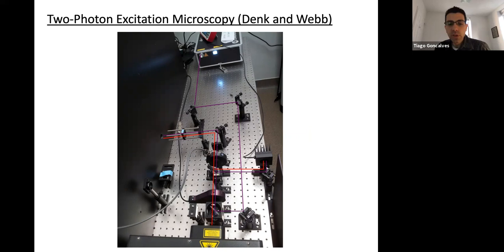So a little bit about the anatomy of this. Most lasers you'll find do not actually have a dial or anything to tell you, oh, you're going to use more power or less power. The lasers are always on or off. There's nothing else. So all laser systems will need some sort of power control system, and there's different ways of doing it. Usually they involve some sort of polarization control.